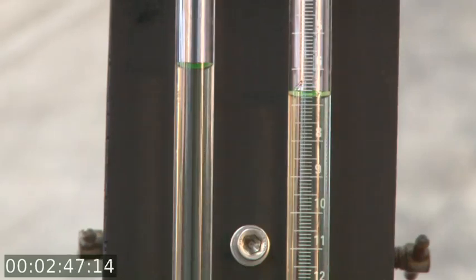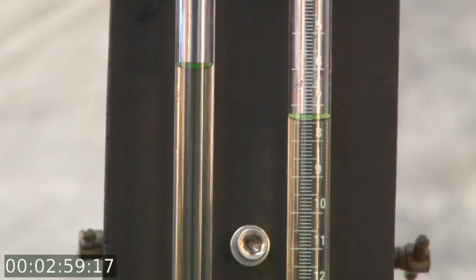Make sure it's pushed down into the water as far as it can possibly be. And it doesn't need to be that vigorous on the shaking. See, this is just not going to work at all for filming, is it?